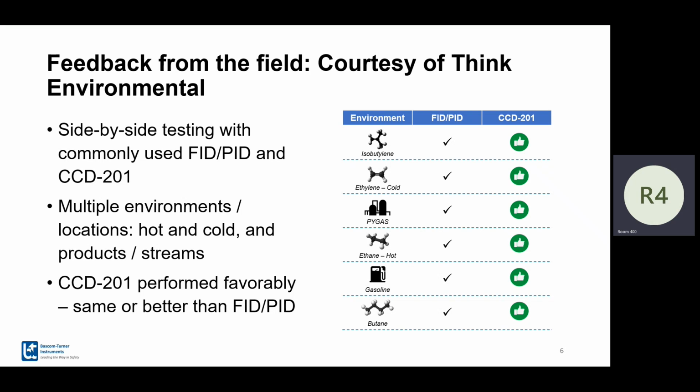We can give the short answer, and then we'll let Nikolai go through his formula, which is sort of proprietary: anything that can combust, we can detect. We have response factors developed and confirmed for about 25 or 30 compounds right out of the book, but if it's new, we can model it and make some adjustments. It's a little bit science, a little bit art to make sure we get it right on. So that's a great question. Thank you.